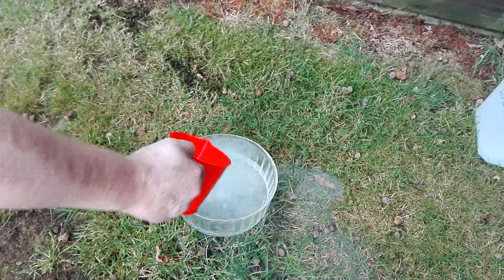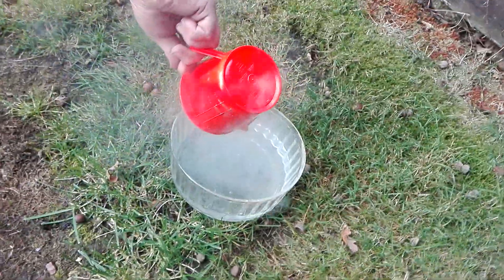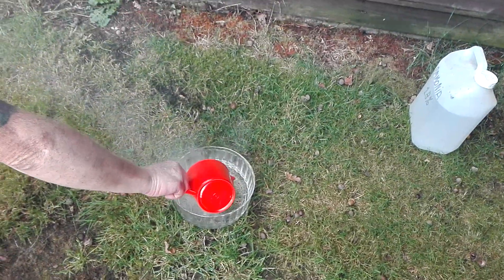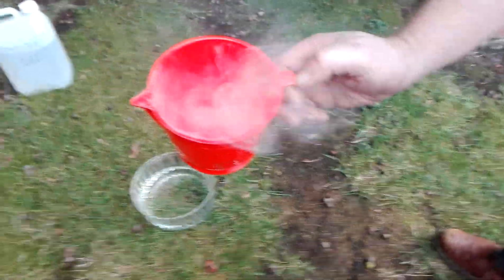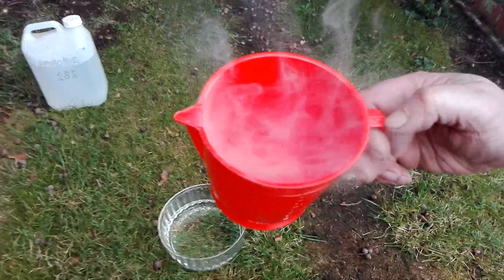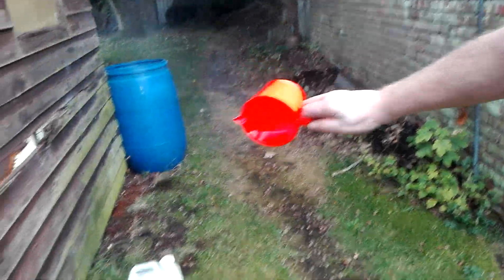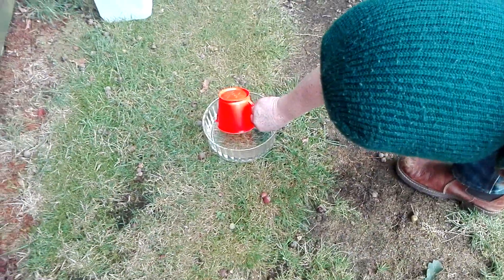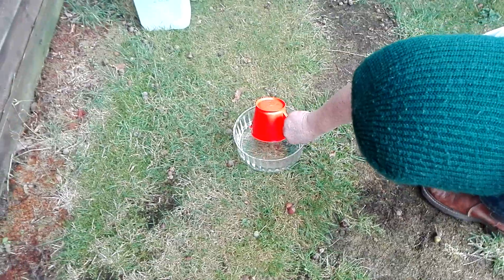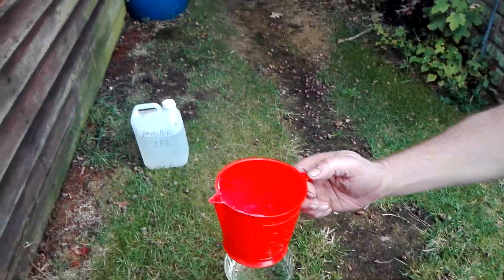Oh yeah, that's what they call exothermic — it makes a lot of smoke. The ammonia gases are going back into the cup and producing smoke. Smoke coming out. Ammonia gas is coming up and reacting with the hydrochloric acid, and they're doing it again.